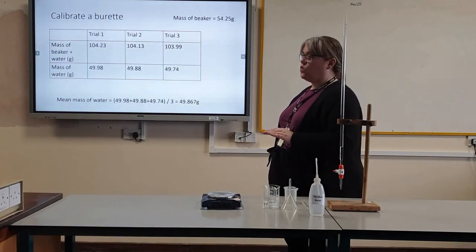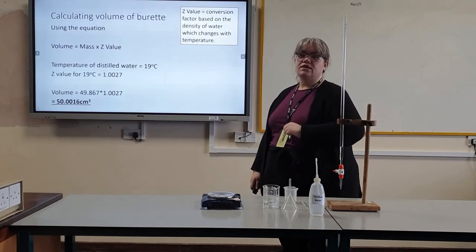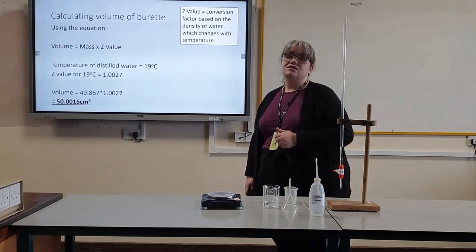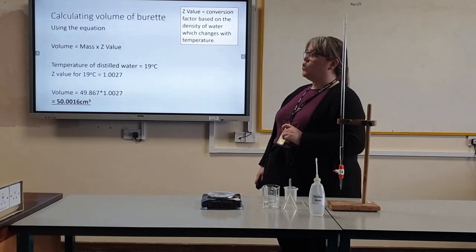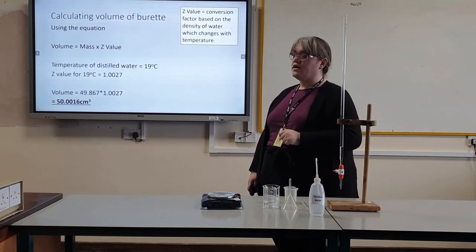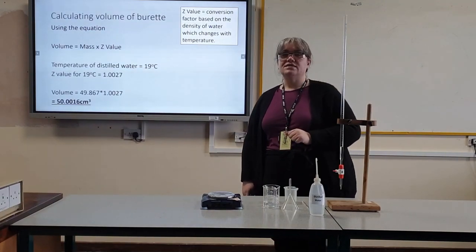The mean mass of water for my calibration was 49.867 grams. To work out the volume held in my burette, use the equation: volume equals mass times the Z value. The Z value is a conversion factor which takes into account the density of the water at different temperatures. The temperature of my water was 19 degrees Celsius, therefore my Z value is 1.0027. To work out the volume of water in my burette, I do 49.867 times 1.0027, which gives me 50.0016 centimetres cubed.